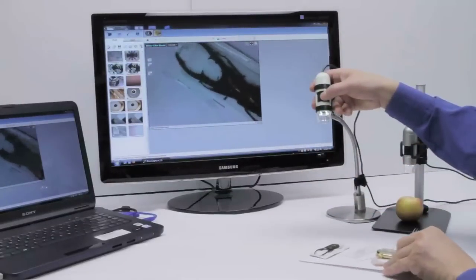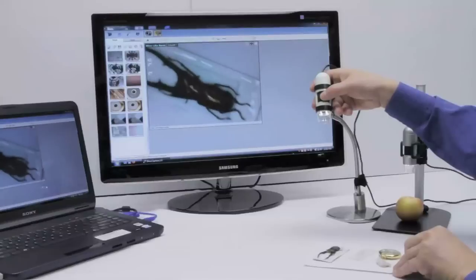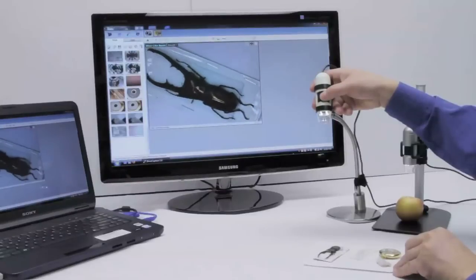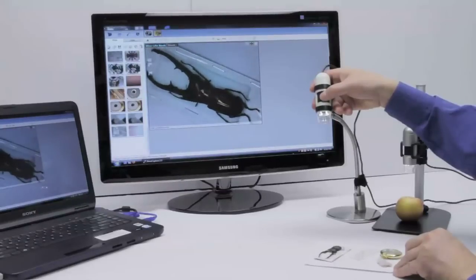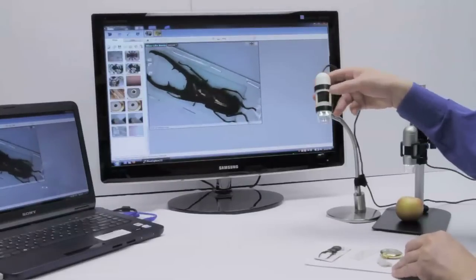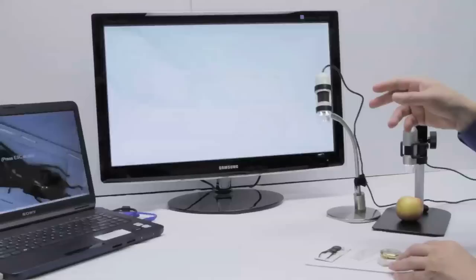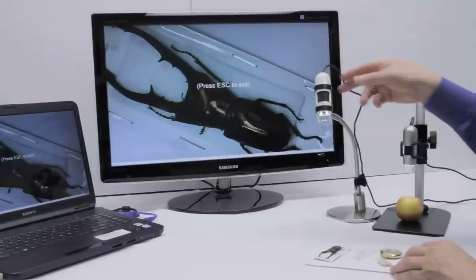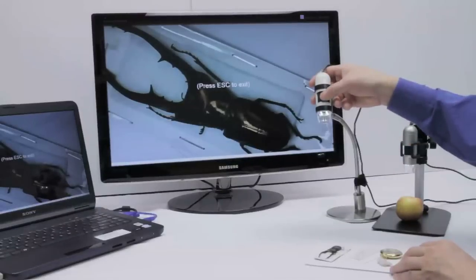Using a CMOS sensor to ensure most accurate color representation, photographing is easy with the 2011.